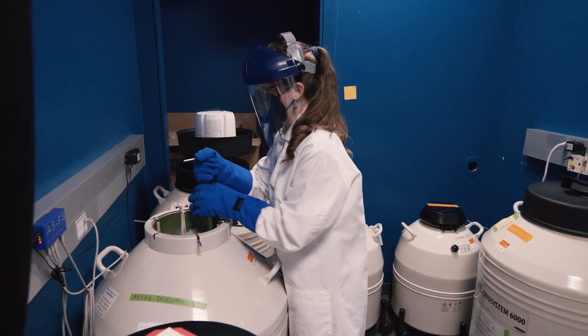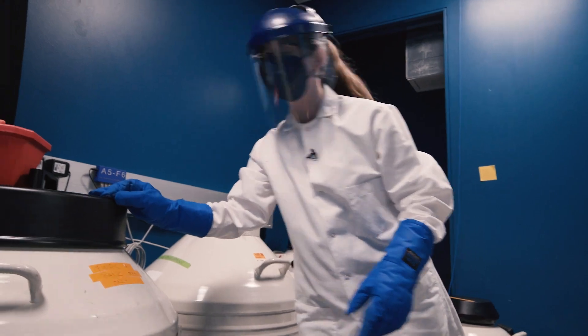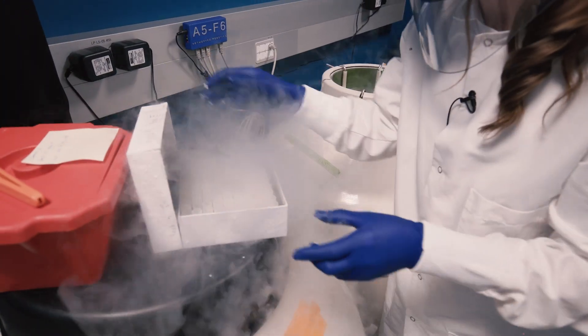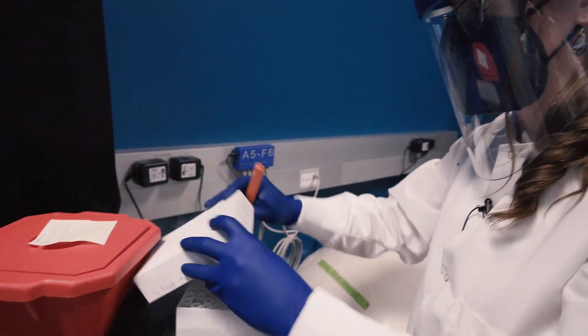These can get kind of heavy and I'm kind of short, so I'm going to go into box F. Here we have all of our cells. I'm going to put that in a little cooler of dry ice so that they stay cold.